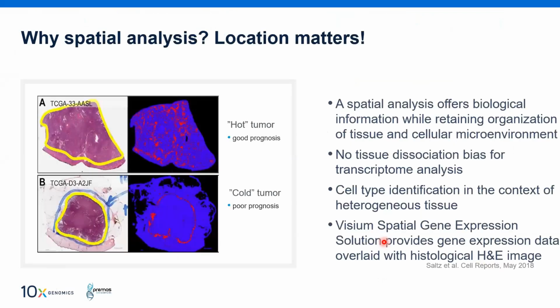Now, as I told, single cell technology is also important for tissue sections, and people want to map the data to the tissue location. So why it is very, very important: these two sections are the stained slides of two different tumors, and the red and blue are the tumor and the tumor infiltrating lymphocytes.